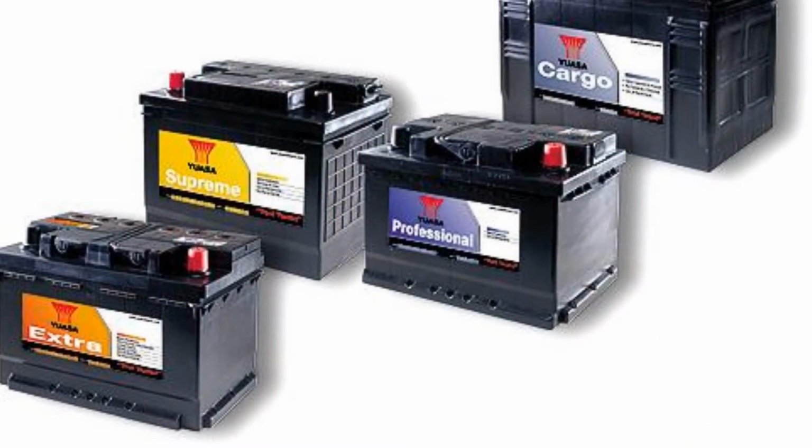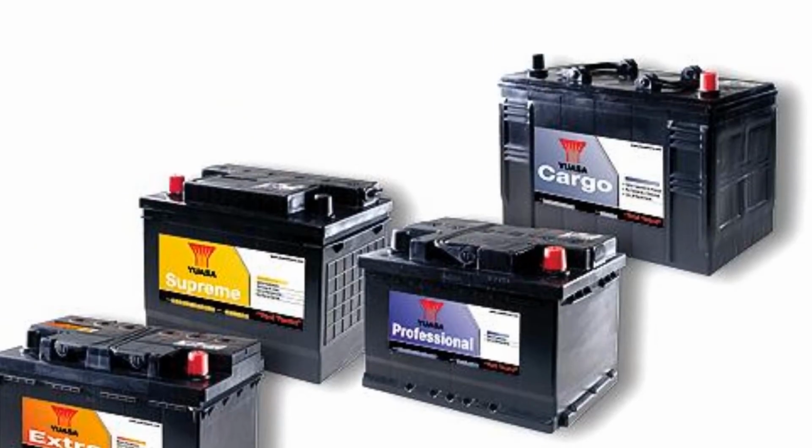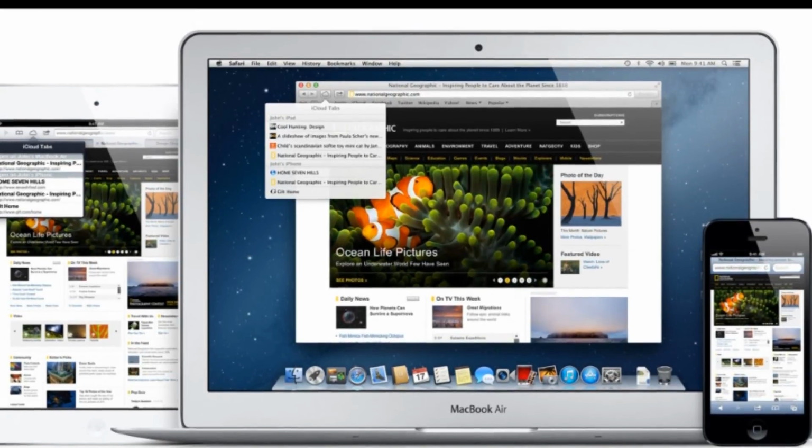We like this experiment because we now understand how a battery functions, and also because these kinds of things are in our daily life, like in our computers, cell phones, and other electric components.